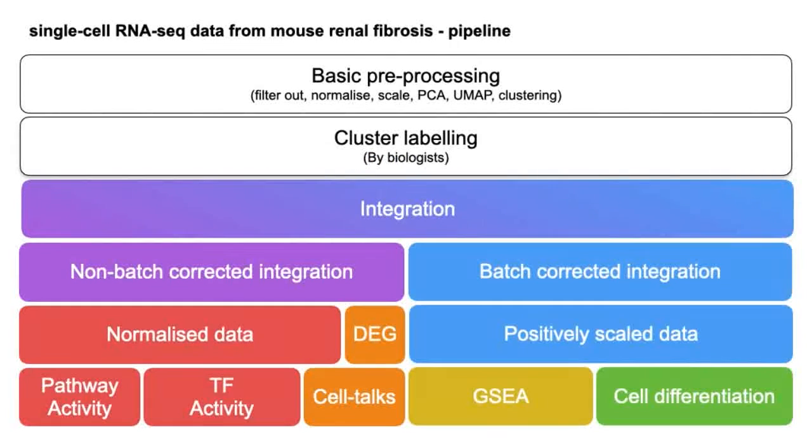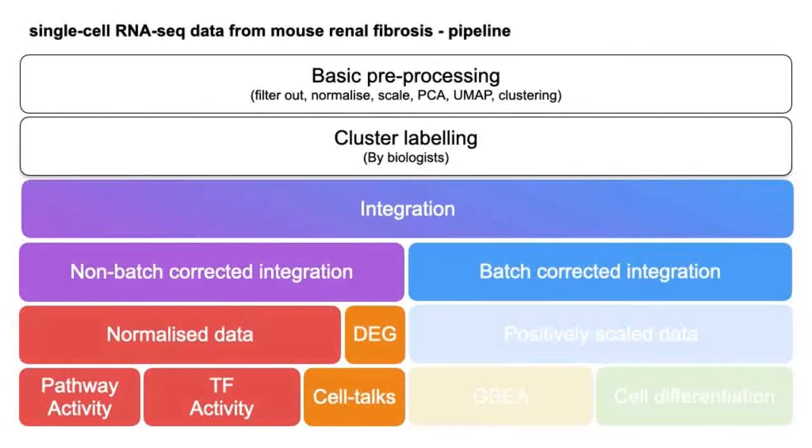For the 5 different integrated data sets, I performed the 5 different studies to infer the pathway activities, transcription factor activities, intercellular communication, gene set enrichment test, and the cell differentiation. I will explain these 3 parts together as functional studies.